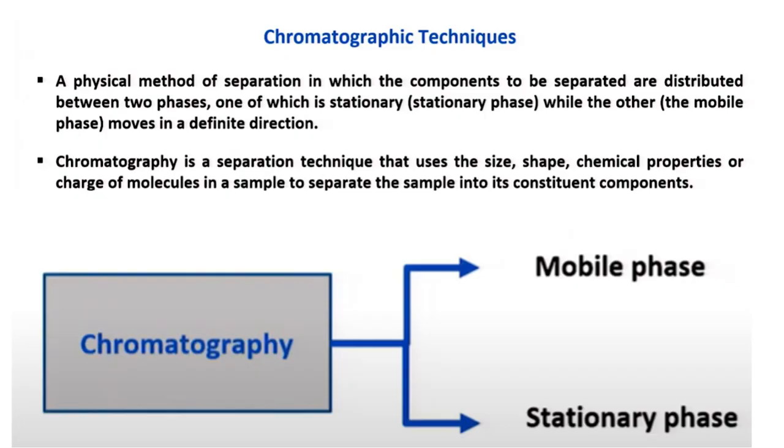So, today, mainly we will focus on other characterization. It's better to say other techniques to purify your samples. Chromatographic technique is basically a separation technique, and it was basically developed by a Russian botanist. So we will discuss different chromatography today.